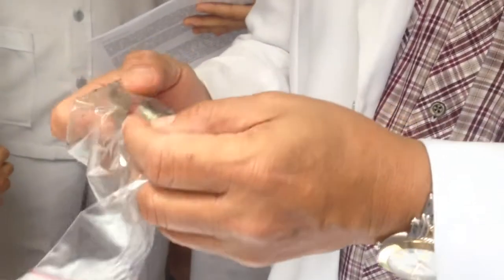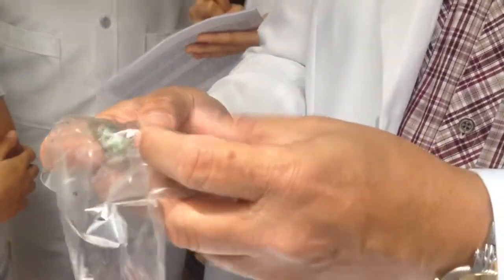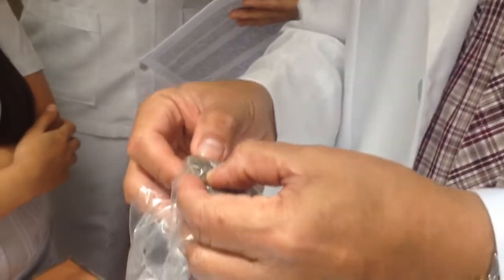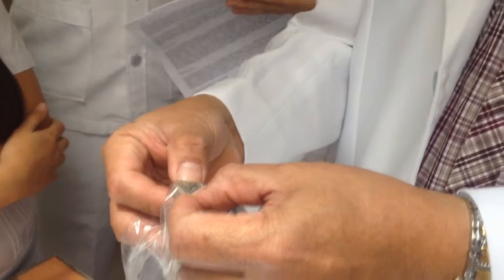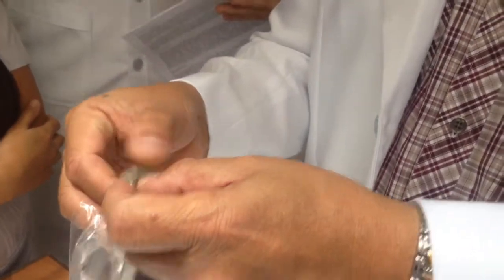Whenever you have a colored lesion, it is malignant melanoma until proven otherwise. So what did we say will be the critical size of a pigmented lesion? 0.6. This is more than 1 centimeter. Plus the ABCD, irregular boundaries.